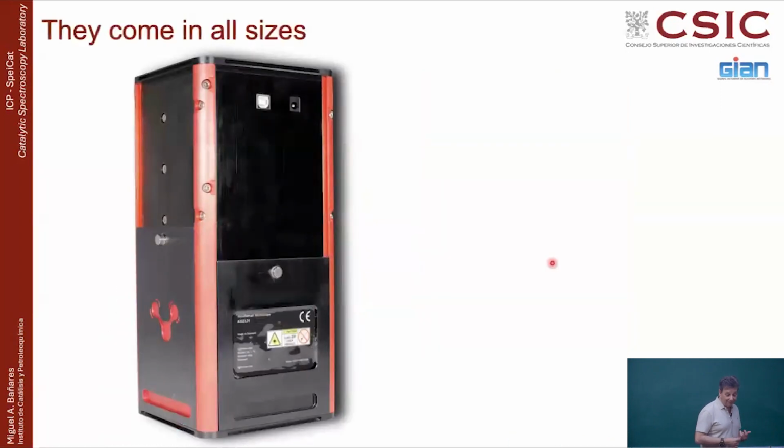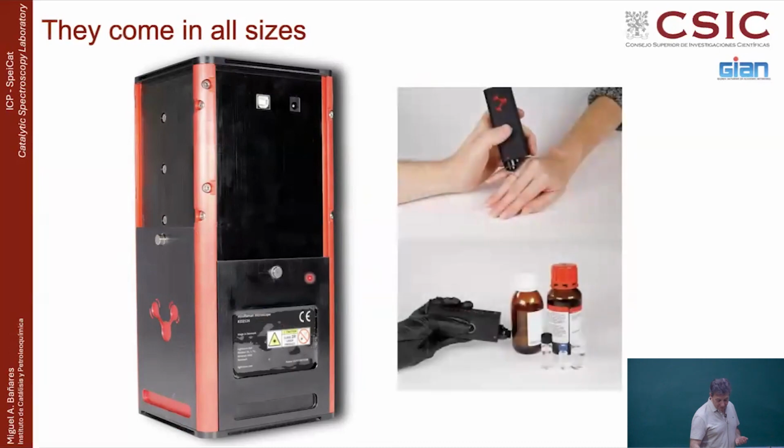But they can come in any size. For instance, I don't know if you can imagine the size of this Raman spectrometer, but it is like this. I don't know why they put this photo. It looks like a big rack thing, but it's actually this one. And it has a portable thing that goes into it, and you focus through the glass into the sample. The glass is transparent to Raman, so you can identify liquids. These kinds of portable systems are becoming increasingly popular in the past few years.